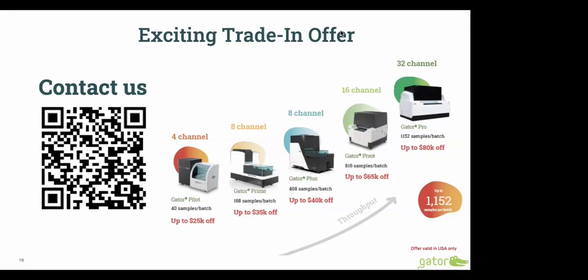How should non-specific binding with crude media be eliminated? For crude media, what we recommend is to pre-wet the biosensors in the blank media for about 15 minutes. That will help minimize non-specific binding.